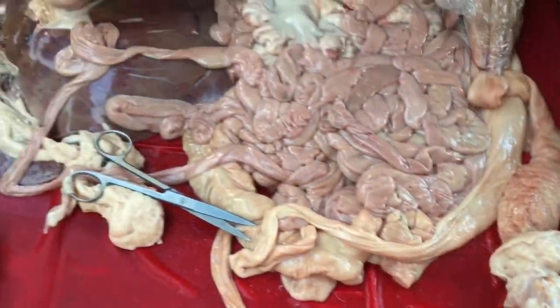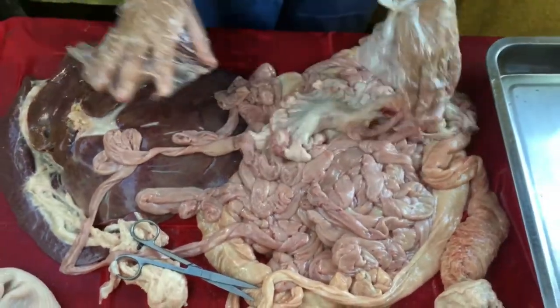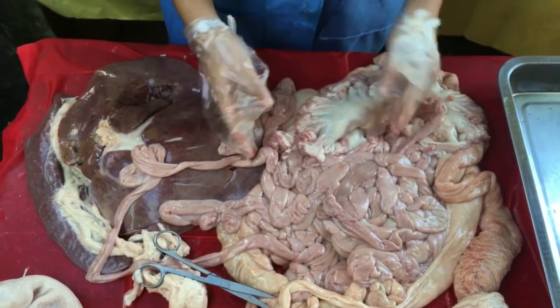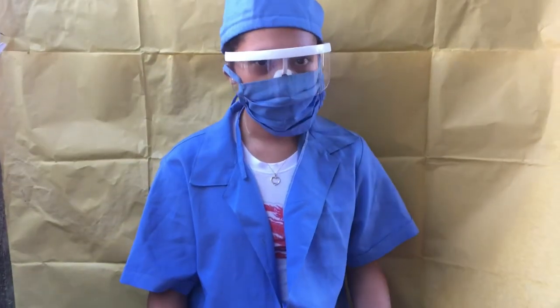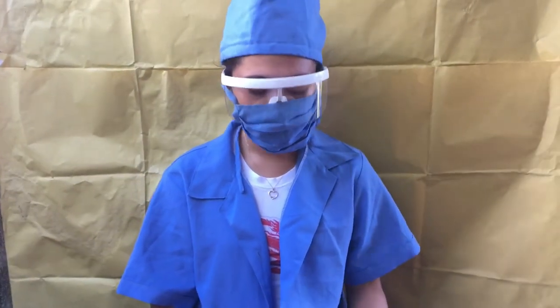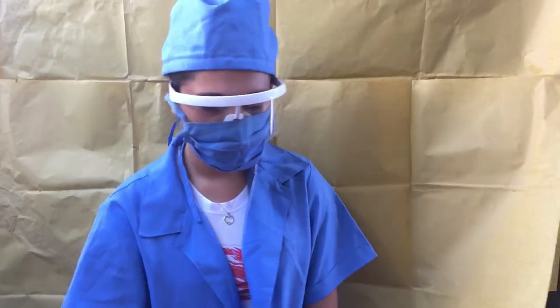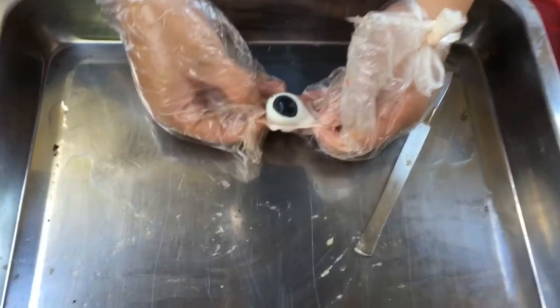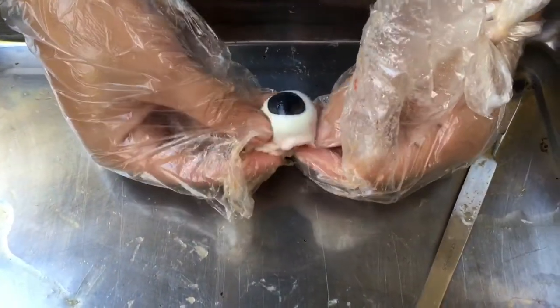Now I'm done with the digestive system. I'm done dissecting the digestive system. I am now going to dissect the eye of the pig. So we will move this first. And now I am going to dissect the eyes of the pig.